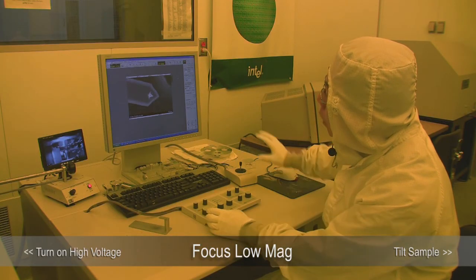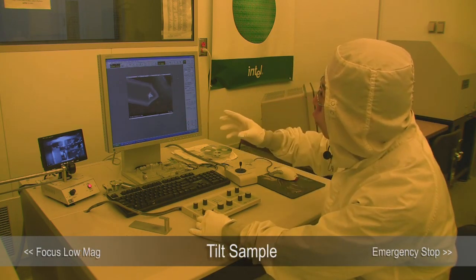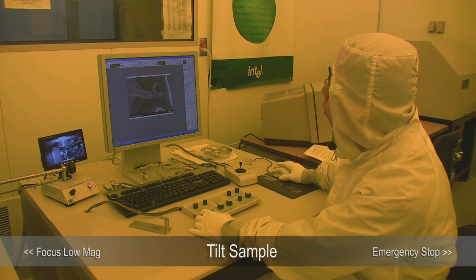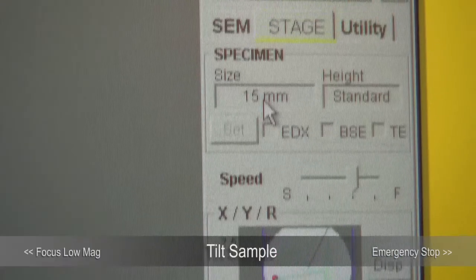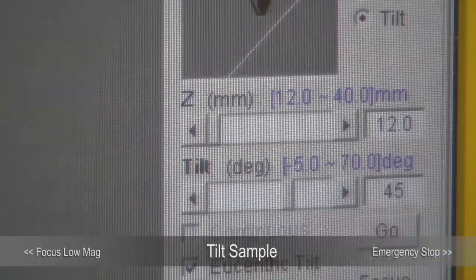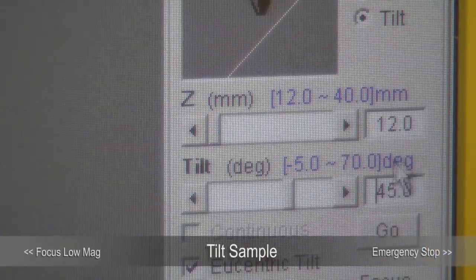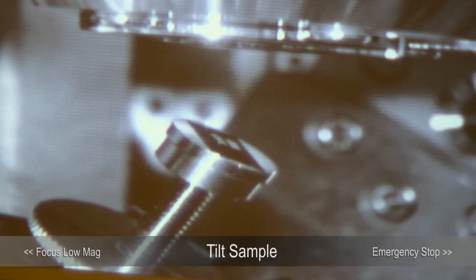Because we're looking at the tip head-on, you can't really see the tip, so I'm going to tilt to give you a better look. Go to the stage and click Tilt Priority. I'm going to set it to 45 degrees and hit Go — it will move to 45 degrees.